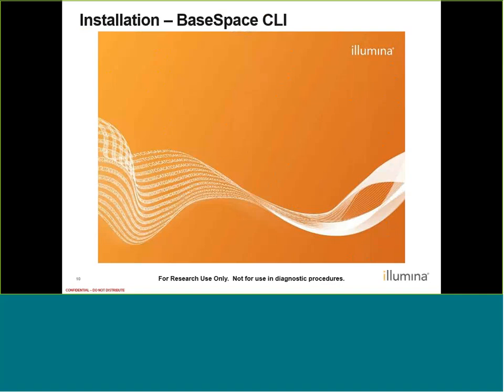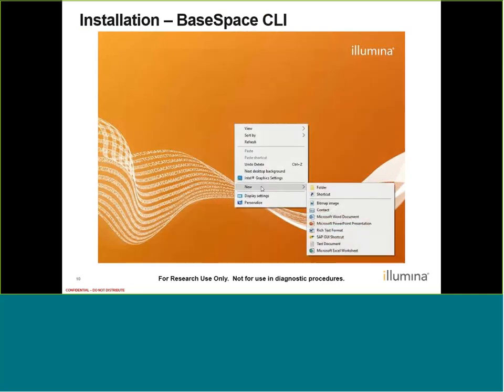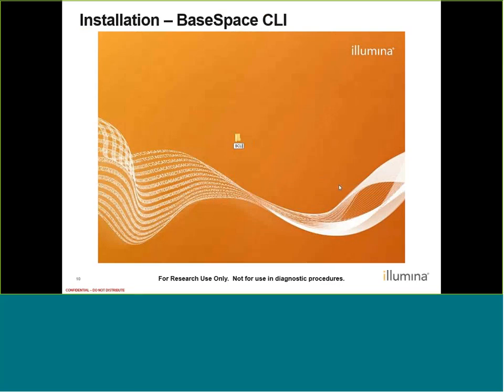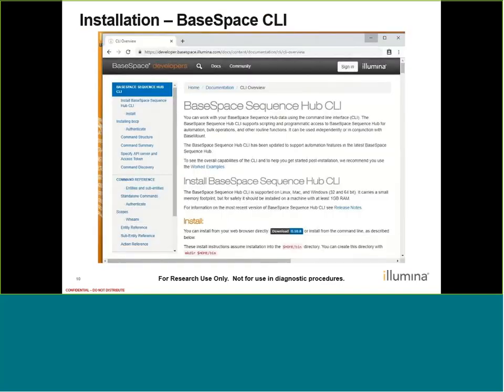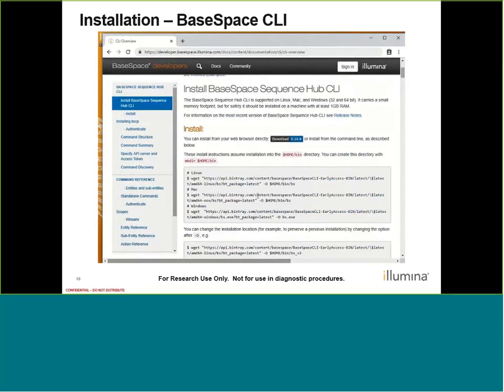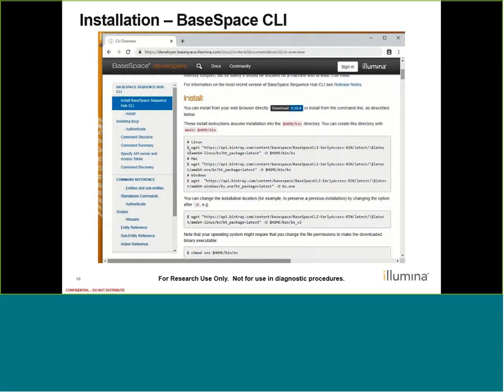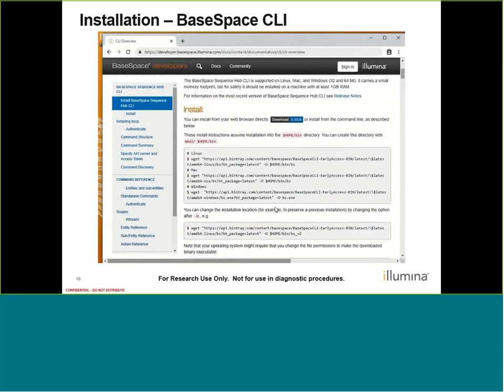Let's take a brief look at our alternate installation path for CLI. Like in the instructions, I'm going to go ahead and create a folder and I'm going to name it BCLI — this is where I'm going to put my script. Then I'm going to open my browser and go right to the CLI developer page. Right here in this section, we can see the actual commands that you would use in the command line to download the packages. Each one is a little bit different, but they use wget.